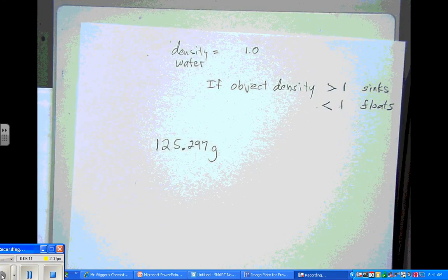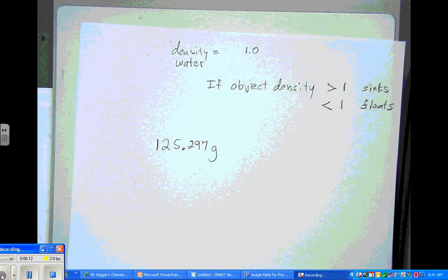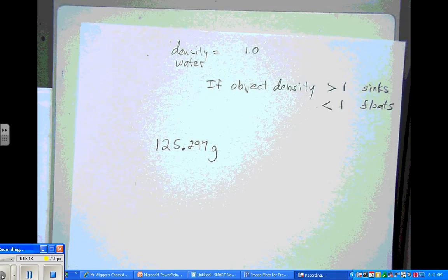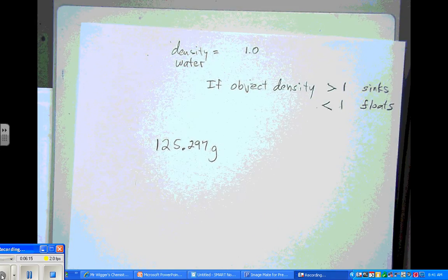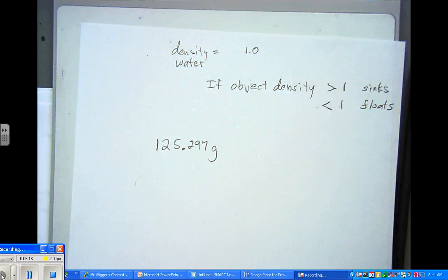So that's how you measure, or that's how you read, a triple beam balance. Thank you so much!